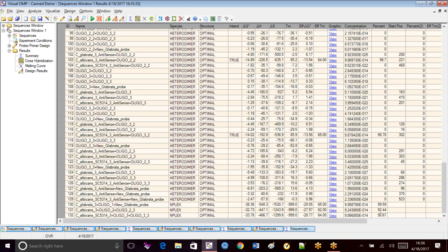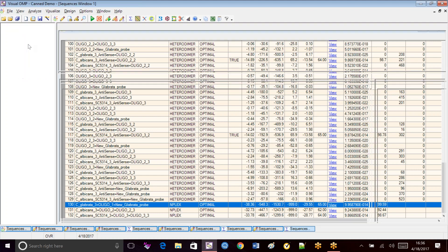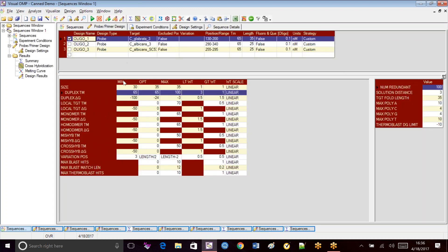We added that to our N-Plex. And sure enough, we now see that the percentage bound has gone up. So again, this is for primers and probes that are designed in VisualOmp. If you want to try to nail your multiplex right out of the box, my advice is to go to the advanced parameters.